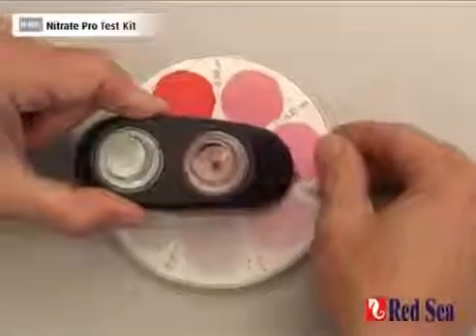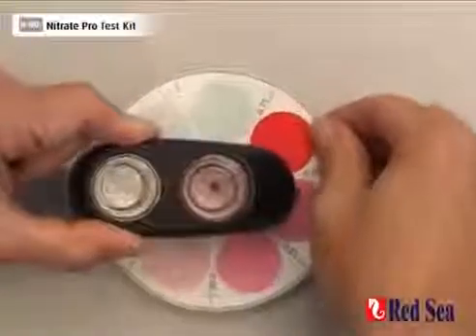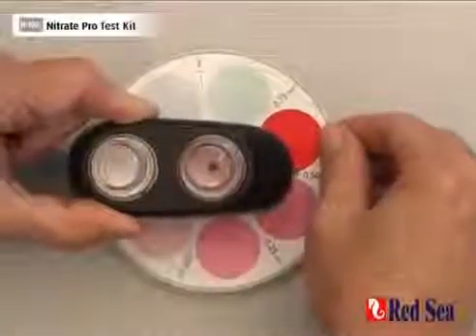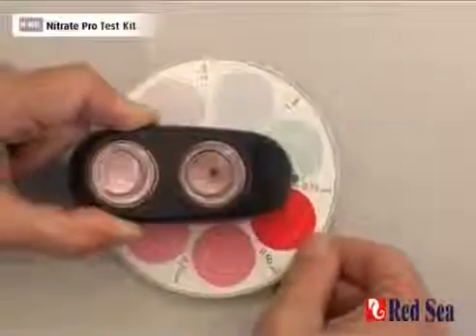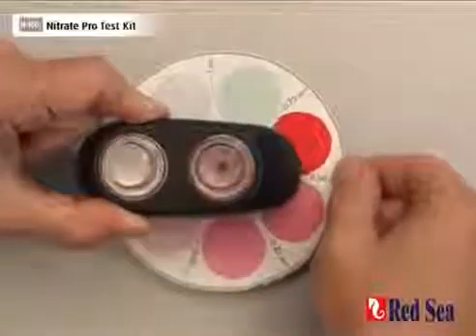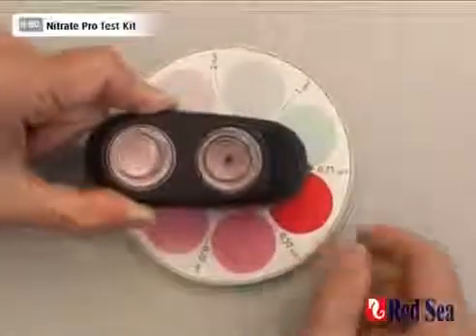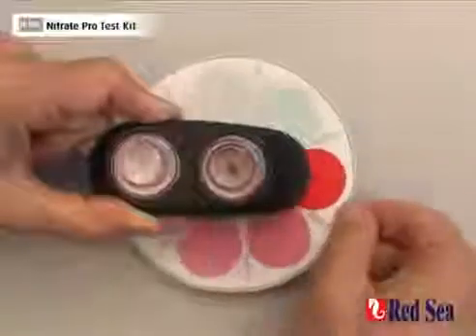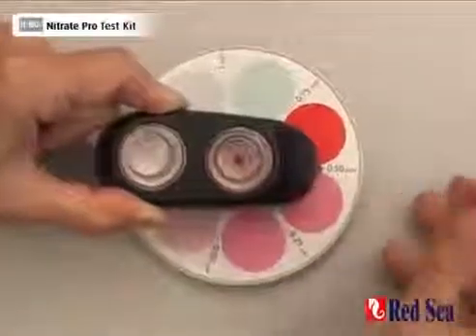So we've waited our nine minutes, and now we just have to rotate the color disc until we get our color match. Here we can see that we are a little bit pinker than the 0.5, not quite as pink as the 0.75. So that means that our actual nitrate reading is somewhere between 0.5 and 0.75, and so we can assume we've got a level of around 0.6.